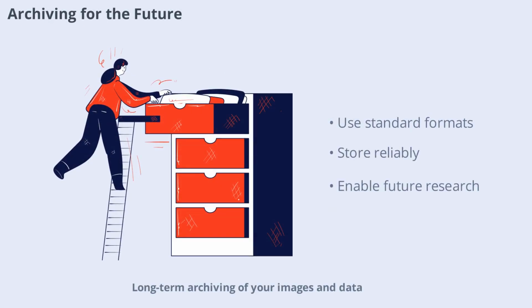Long-term archiving of your images and data ensures they remain accessible for future research. Use standardized formats and reliable storage solutions. Well-archived data can be revisited for new analyses or to answer questions that arise later.